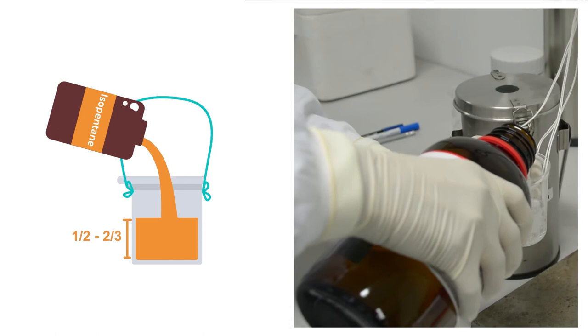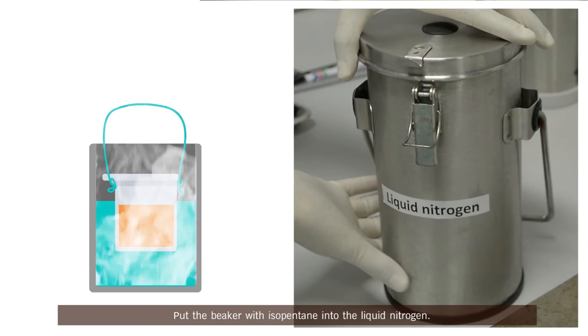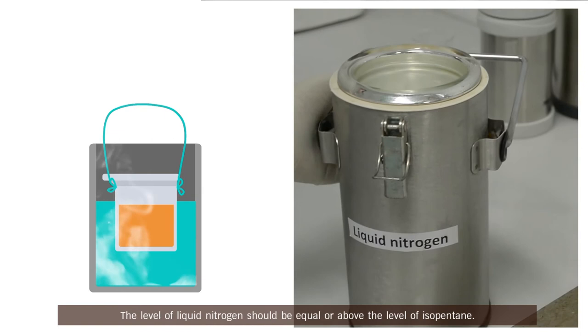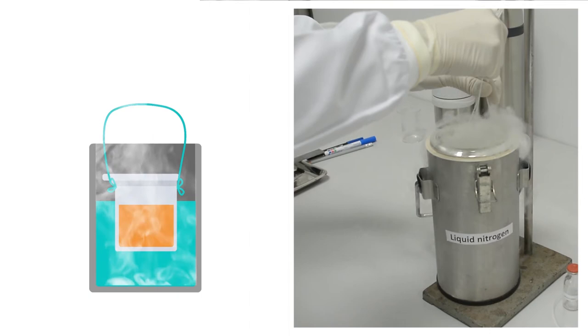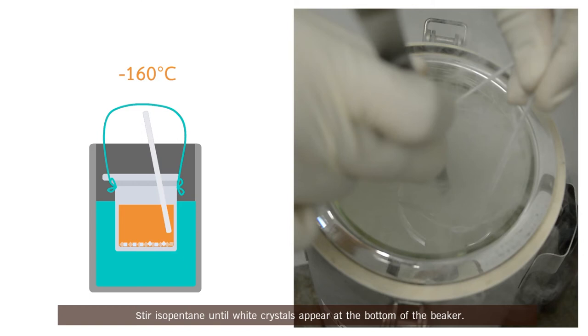Put the beaker with isopentane into the liquid nitrogen. The level of liquid nitrogen should be equal or above the level of isopentane. Do not let liquid nitrogen mix into isopentane. Stir isopentane until the crystals appear at the bottom of the beaker. Now the isopentane temperature is ready for freeze fixation at minus 160 degrees Celsius.